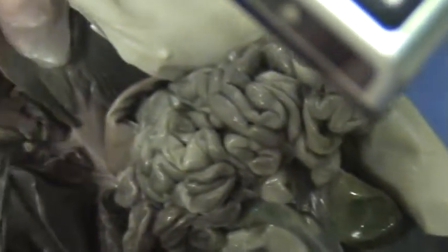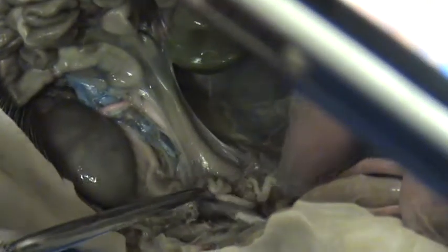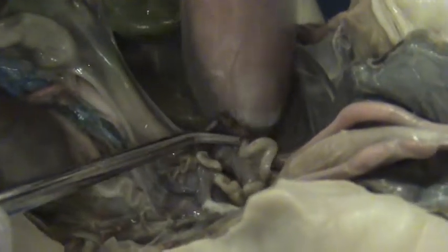The umbilical vein is this one that was coming out of the liver. Because initially when you started your dissection, it was like this, right? Okay, so that's it. That's the other end of it. Okay. This is a female pig. So what I'm looking for here is the, okay, out at the end, little bean-like thing is the ovary. All of this curly stuff are the uterine horns. I was talking about this in lecture. So ovary, uterine horn, ovary, uterine horn.